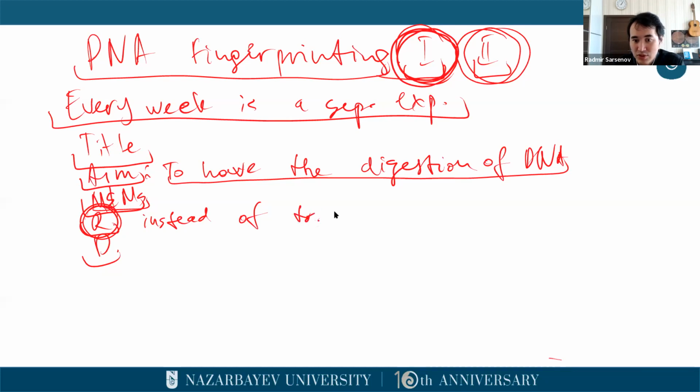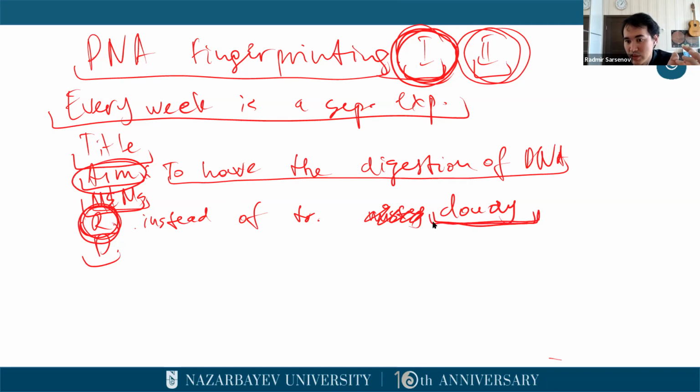transparent solution, you actually have very misty, if I can say so. So mist, cloudy, yeah. You have a cloudy solution. Okay, so you write it down. So you write like, as a result of today experiment, we obtained a cloudy solution that we will be analyzing next week. Okay, so in discussion, you say, it might be cloudy because of this and this and this.